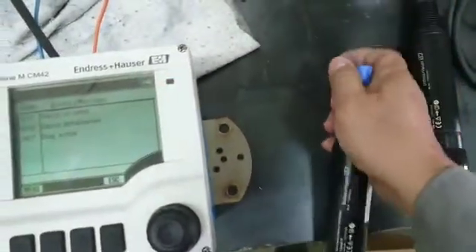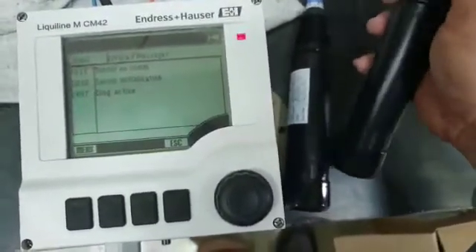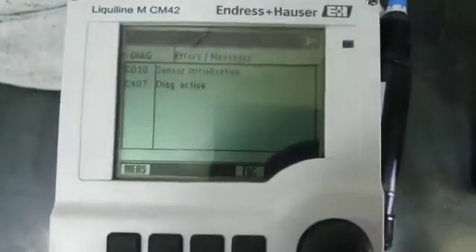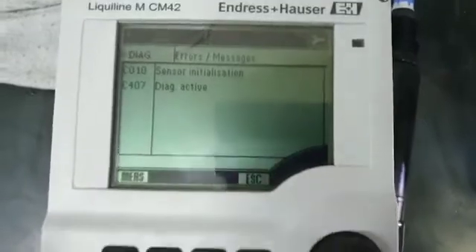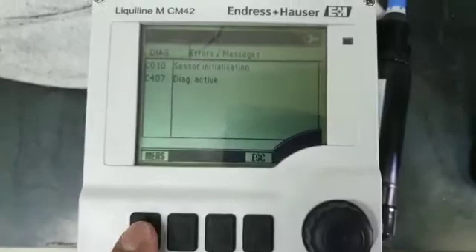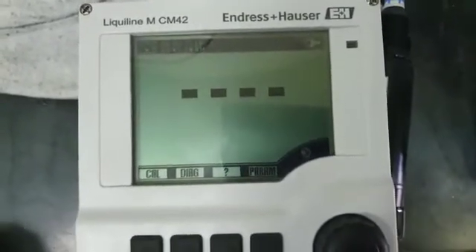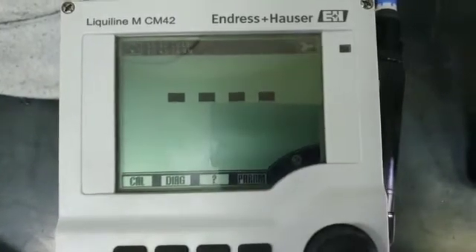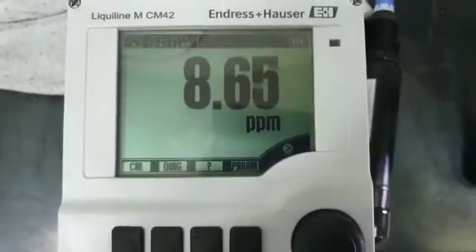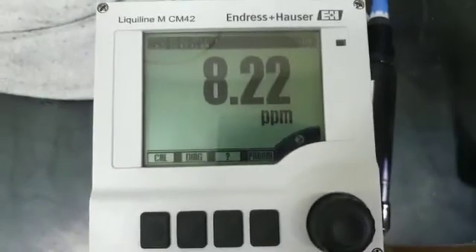I remove the sensor and put a new sensor in. See what happens — the red alarm is gone, the sensor initialization started, and it goes for measurement. The reading comes back immediately.